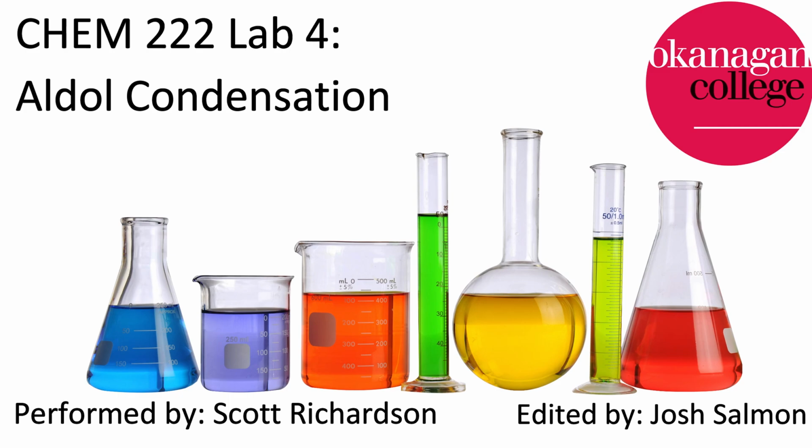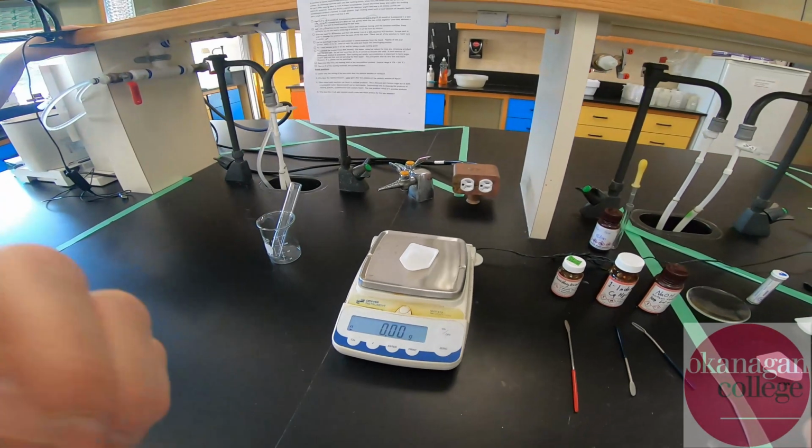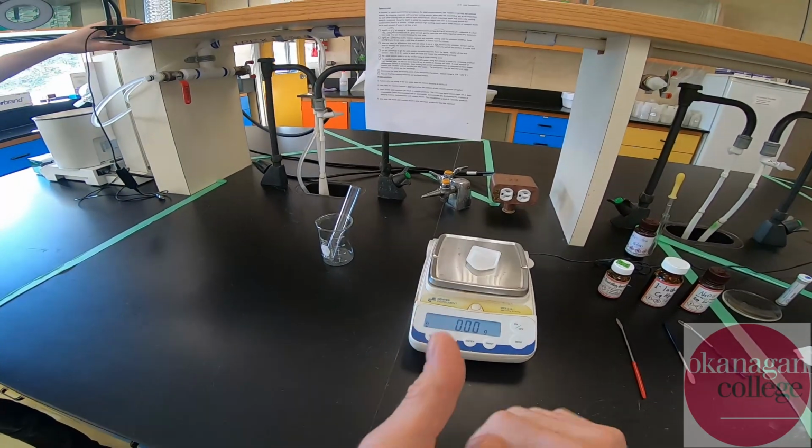At this point, we'll move over to me carrying out the experimental procedures. You'll watch this synchronously with your entire class, and at the end of the video, you'll reconvene with your laboratory instructor to discuss any issues you may have with the experiment, any questions you may have, and clarify the requirements for the laboratory write-up.